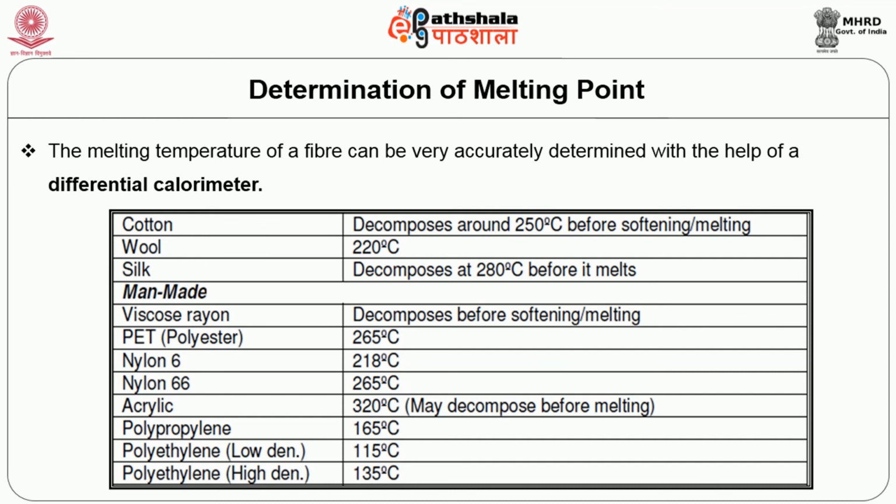If it is an unknown fiber, we can go for the 7 steps, step by step. We can eliminate the possibility of the fiber which is going to dissolve in the solvent. For that, we can find this by the 7-step method. We can identify the fibers of wool, silk, cotton, viscose, nylon, polyester, polypropylene, polyethylene fiber by using the quantitative analysis method.